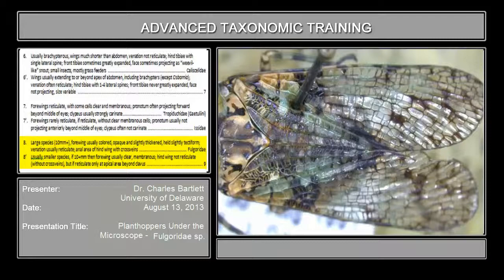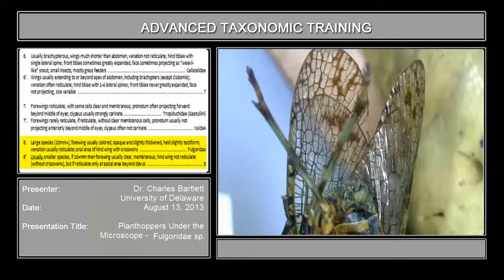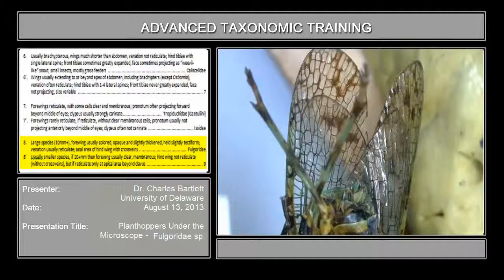Anal area of hind wings with cross veins. It would be convenient if I had one where the wings were spread, but I don't happen to. What I can do is turn it upside down and look at the apex of the hind wing, which you can see right here. You can see all those little cross veins in there — so that is what's meant by the apex of the hind wing bearing cross veins.